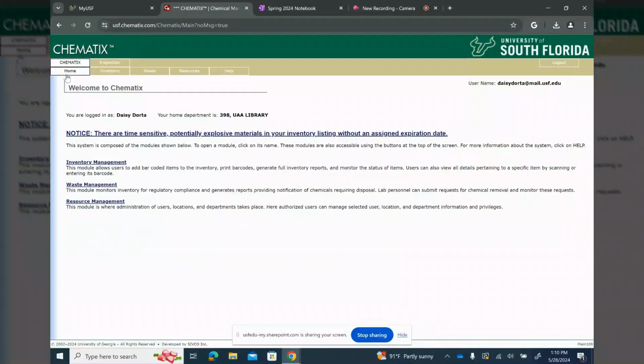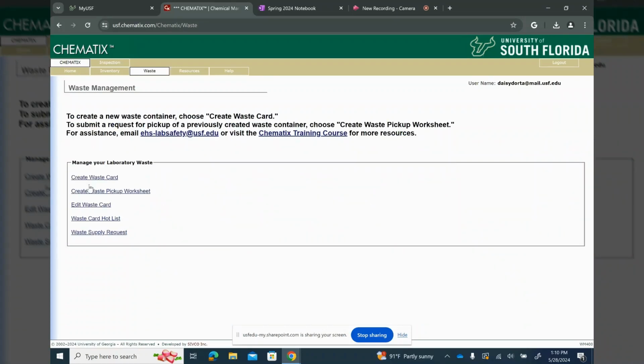So in this video, I'm going to show you how to do waste management. The first thing you're going to do is click waste management. I would like to note that there's two steps with waste management here.